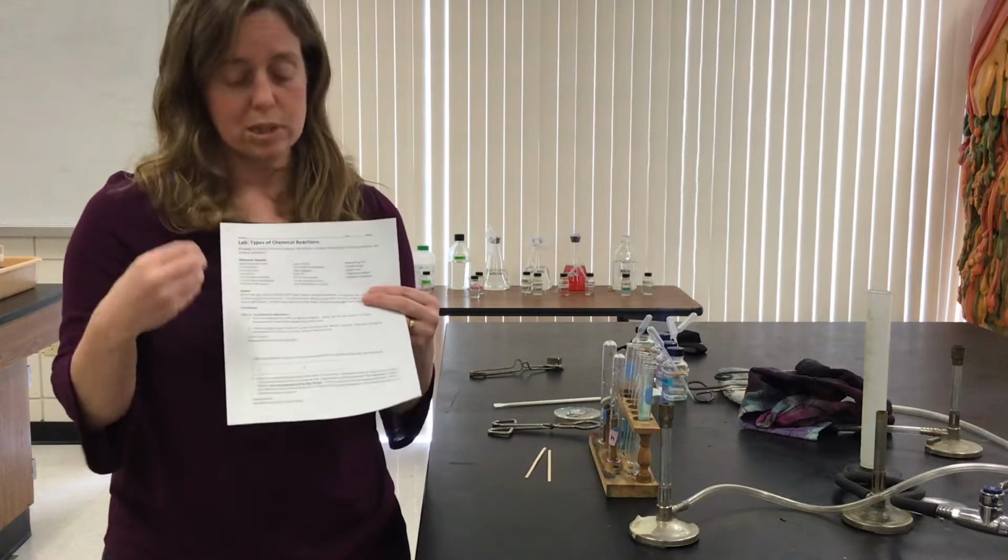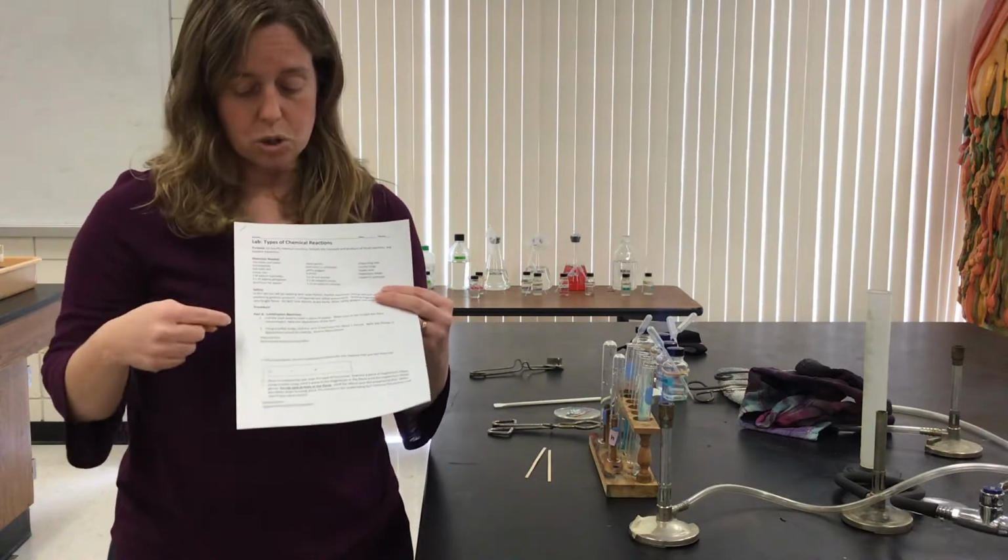Now I'm going to go through with you and kind of tell you as we're going along what it's reacting with and what it's actually producing, okay? Make sure when you're here, you type in the appearance and what it looks like and things like that.